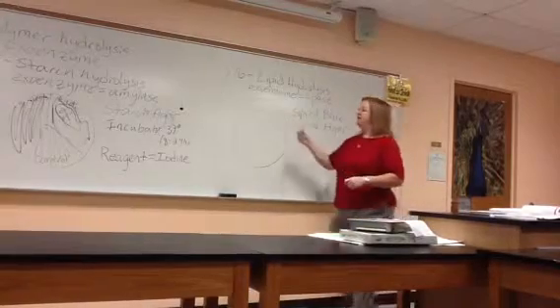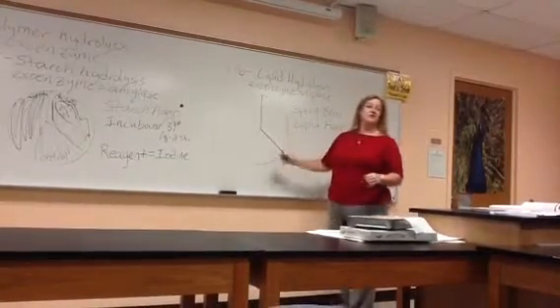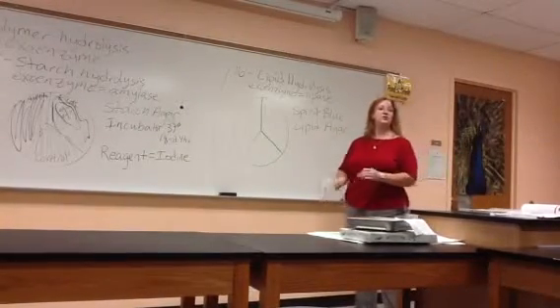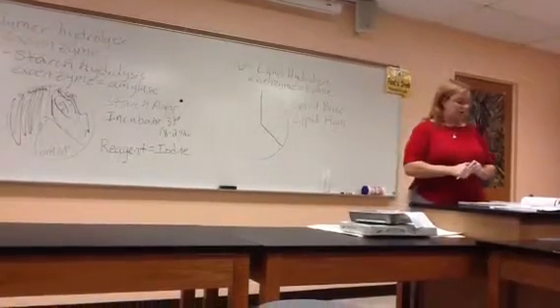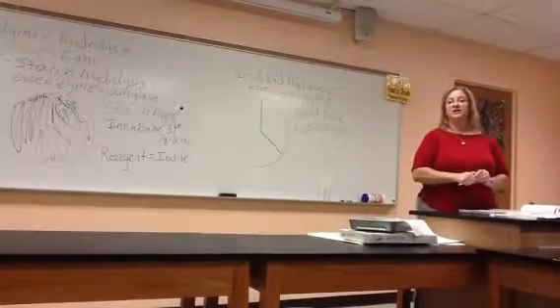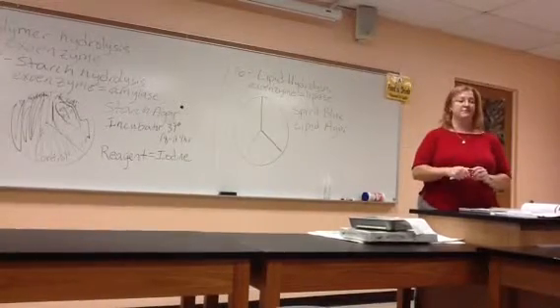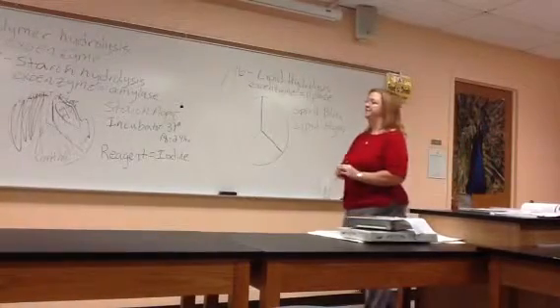You can do the same basic thing. Label the agar side of the plate, divide it into 3 sections. Materials page on 102 tells you which bacteria you're using. Except I've got to make one change. You've got staph, but you don't have Proteus today. Okay, so it says Proteus mirabilis. Use E. coli, the same E. coli that you're using on the first Lab 15 here.